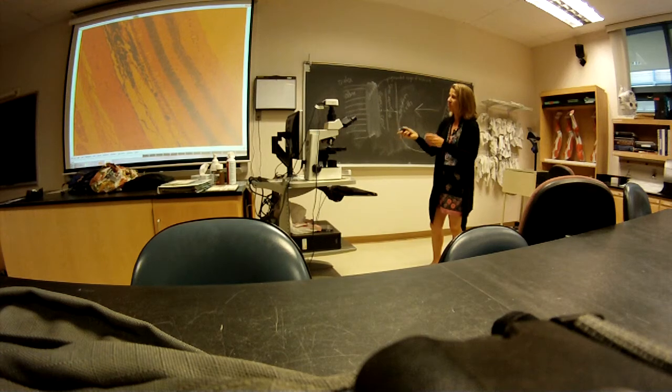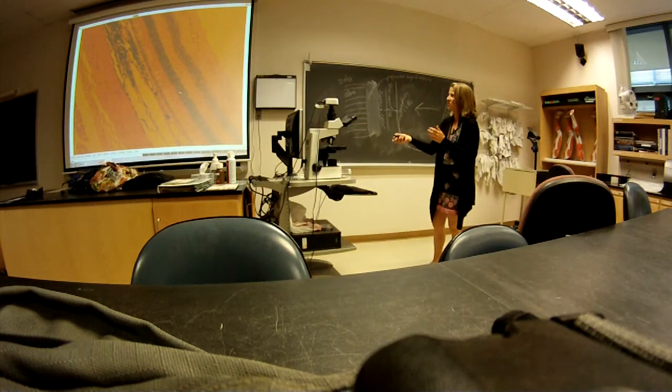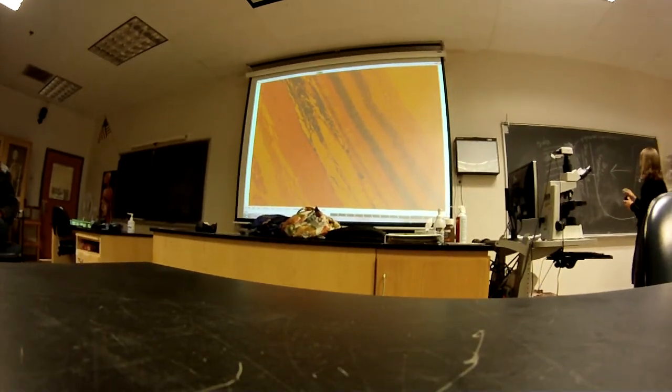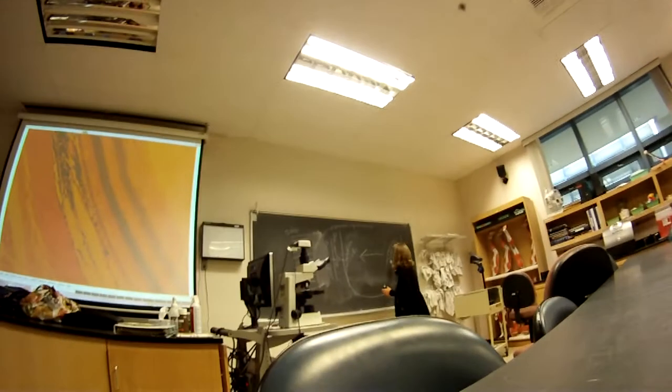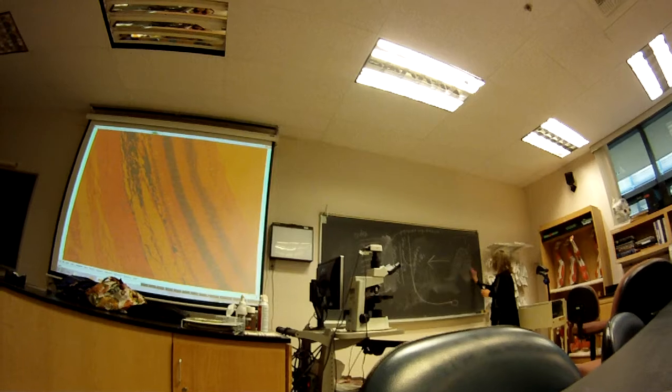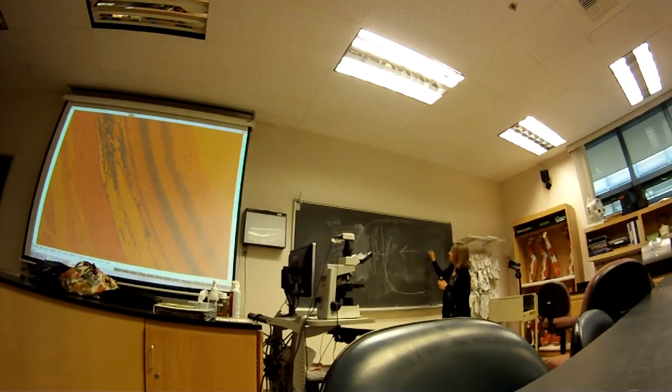These two layers, they look pretty similar. Sometimes this one looks bigger than that, sometimes this one looks bigger. Okay, so it's just positioning. Okay, so then light comes in. I don't know what that is. Well, that's epithelia. That's what you're going to learn tonight. That's simple columnar epithelium. And so light's coming in from this way.